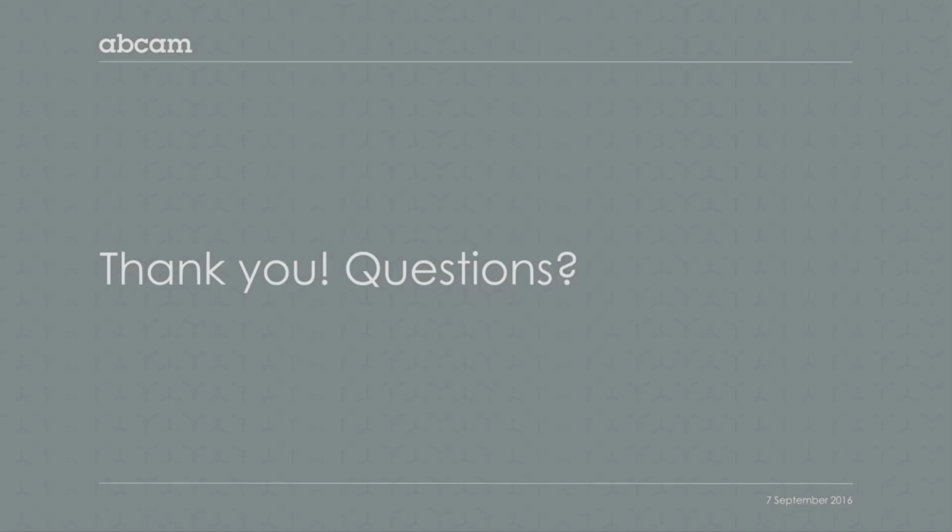Okay, so we have a question from our audience on the RNA-Seq technology. So this is probably for Amit. The question is, are there available methods for single-cell RNA-Seq analysis that would include poly-A-negative RNAs?